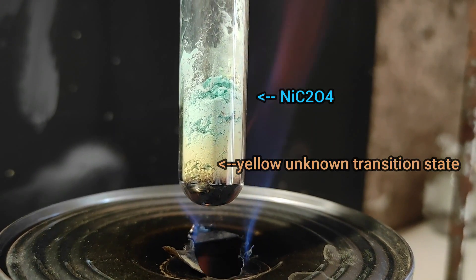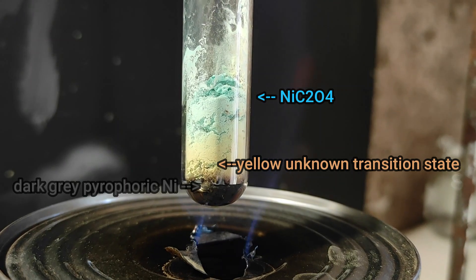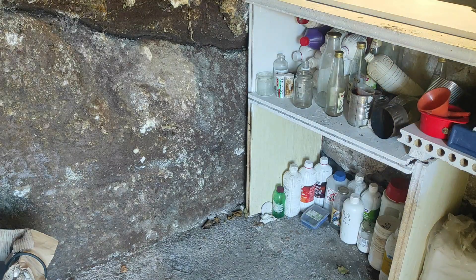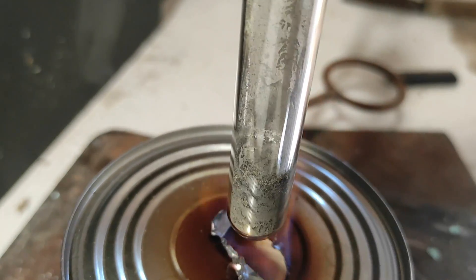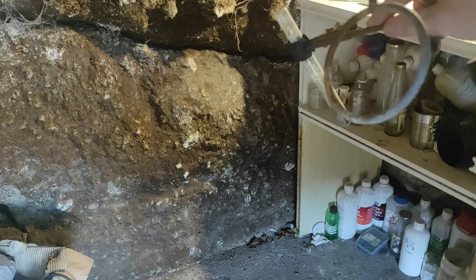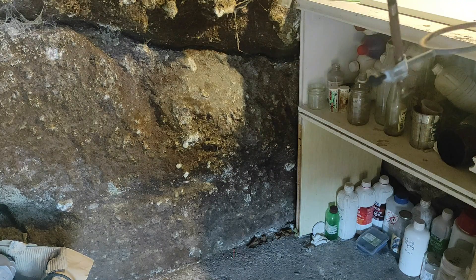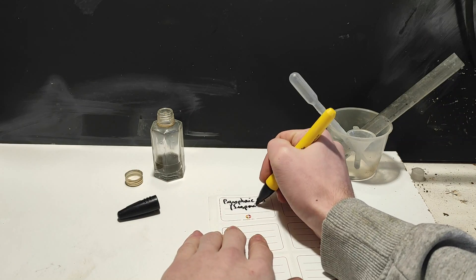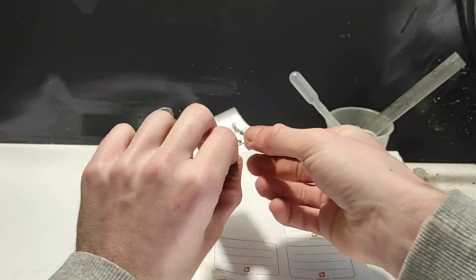I wanted to test if I could make the nickel combust directly in air. To do that, I decomposed another portion of the oxalate and tried to pour it into the middle of the lab. It didn't work the first time, so I tried again — and then it worked twice, so I think this was a pretty conclusive test. I think I just overheated the first batch, but anyway this process seems to work very well.